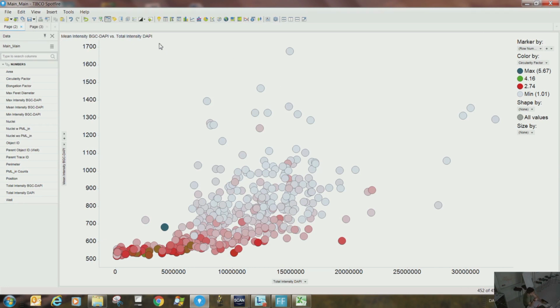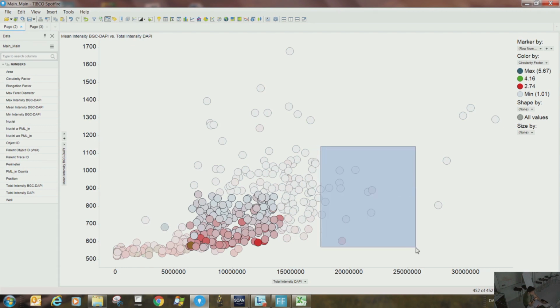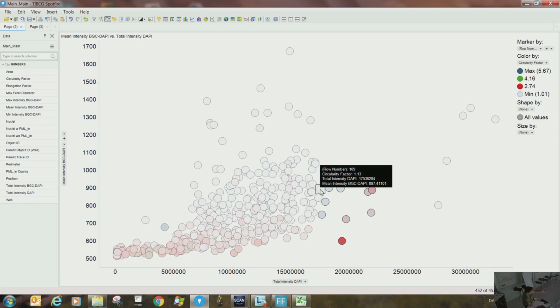That's why you can see that these guys must be in the mitotic phase. These ones will be in G1 phase, these two will be in the G2 phase. But of course it is hard here. But that was a question you asked me, Dimitrios, how do I use a scatter plot in order to define the mitotic cells?